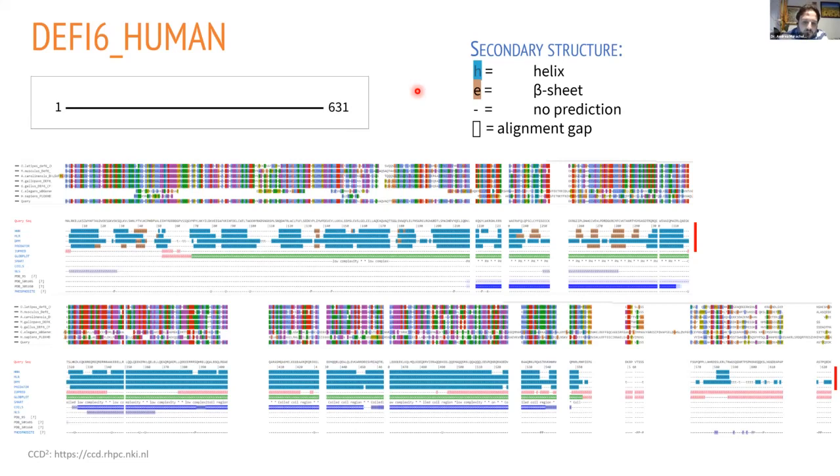So first of all, I would look at the secondary structure prediction. The first 4 lines are secondary structure. And as you can see, there is secondary structure predicted all the way from the N-terminus down to here. Then there's a break, there's possibly a helix, and nothing else. So this tells me that most likely there's a somewhat globular N-terminus, break, small helix, and disorder.